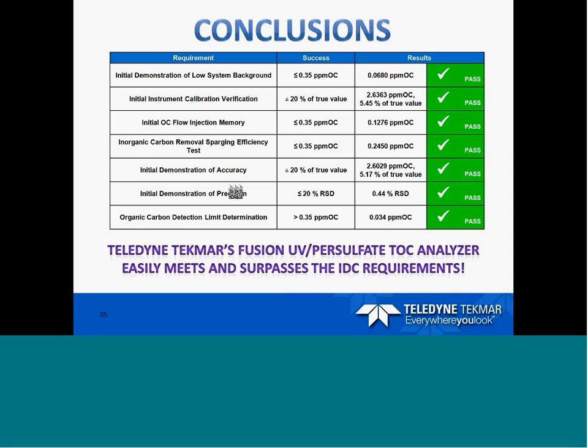I think the majority run either a low-level calibration, which has to be in the front of all your samples, and a medium continuing calibration somewhere throughout your analysis batch. An analysis batch consists of 24 hours and is no more than 20 samples, including all your calibrations or your standards.